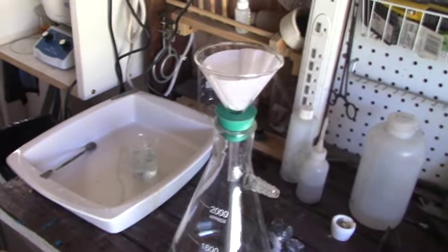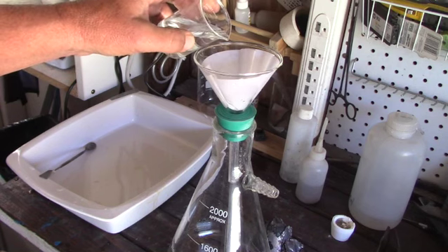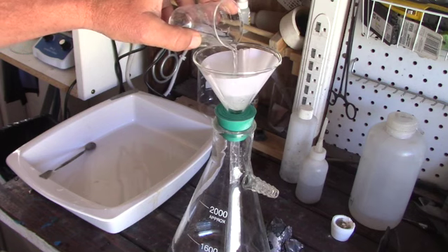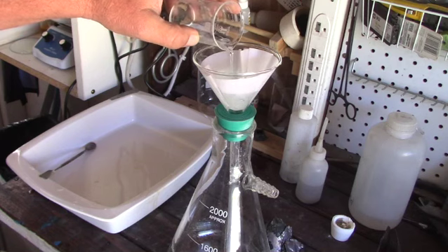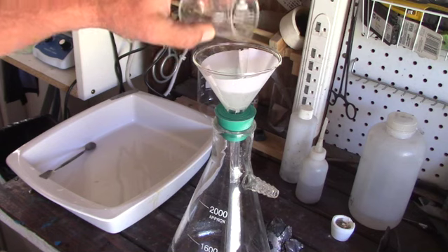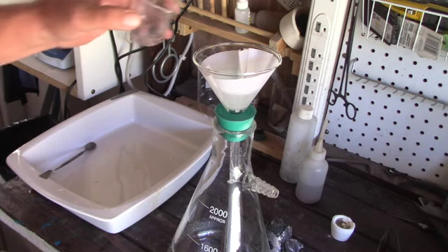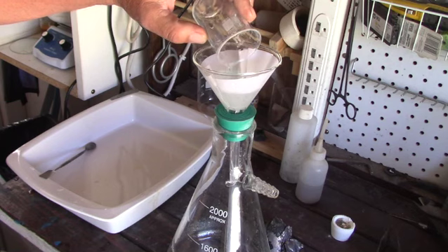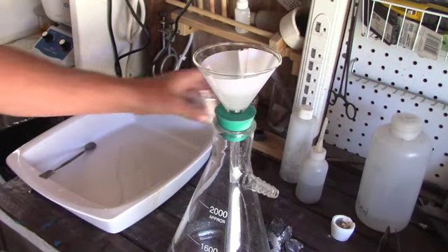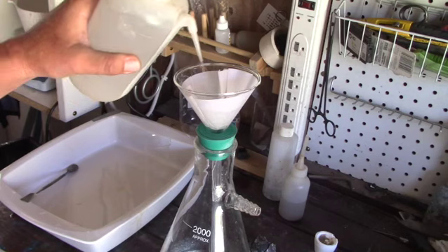Put the filter in the funnel, put the funnel in our vacuum flask, and start adding the solution that hopefully has some silver in it. Being that this solution is fairly clear and doesn't have any sediment in it, I really don't think I needed to do this step, but it's a good procedure to follow a process all the way through — as we saw before, adding the zinc in at the wrong time cost me a couple of extra hours. So we flush out the beaker and make sure we get all the solution, since the solution is our silver.